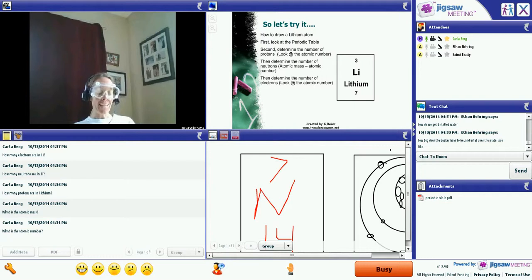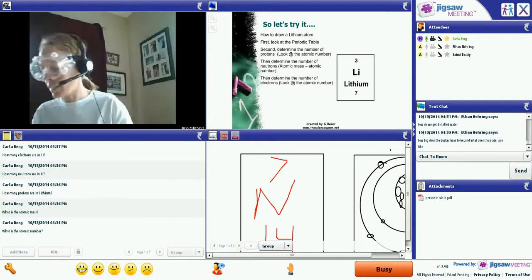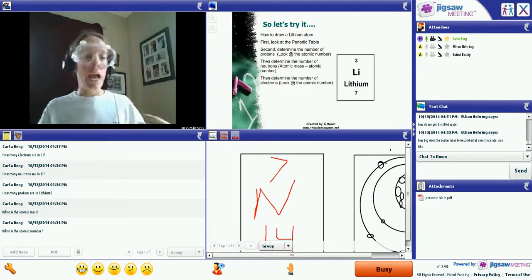This is because the copper iodide precipitate settles slowly. Okay, so with that being said, a precipitate is a solid that forms at the bottom of your well plates. Okay, this lab, hopefully, you will be able to see some precipitates form.